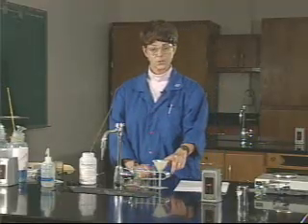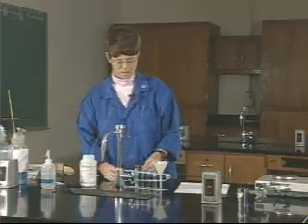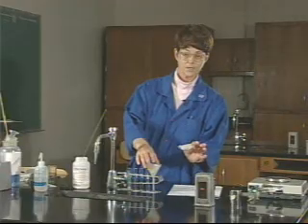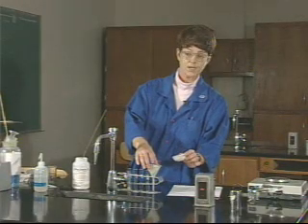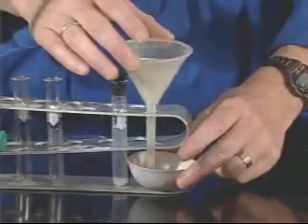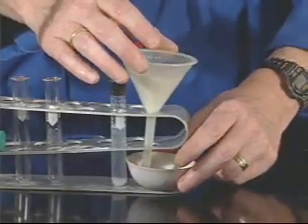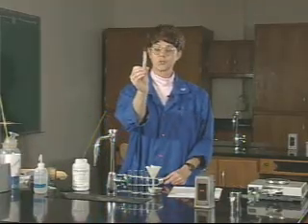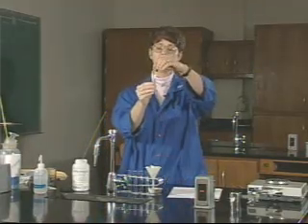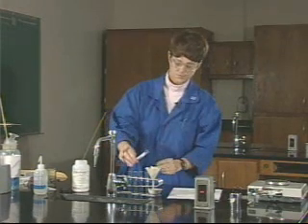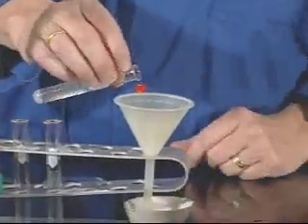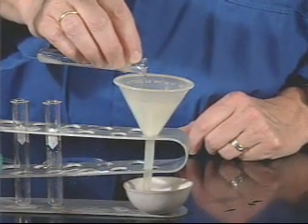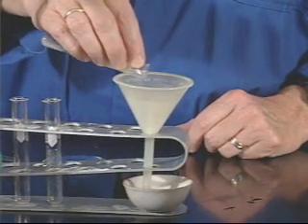The funnel is then placed into a test tube rack. Under the funnel, you want to put the evaporating dish that you're going to use to catch the salt water solution that's filtered. After you've put the evaporating dish under here, you can take the saturated salt solution that you have made and simply pour it through the funnel, making sure that you have three thicknesses of paper on one side and one thickness on the other, otherwise all the salt will also go through the funnel.